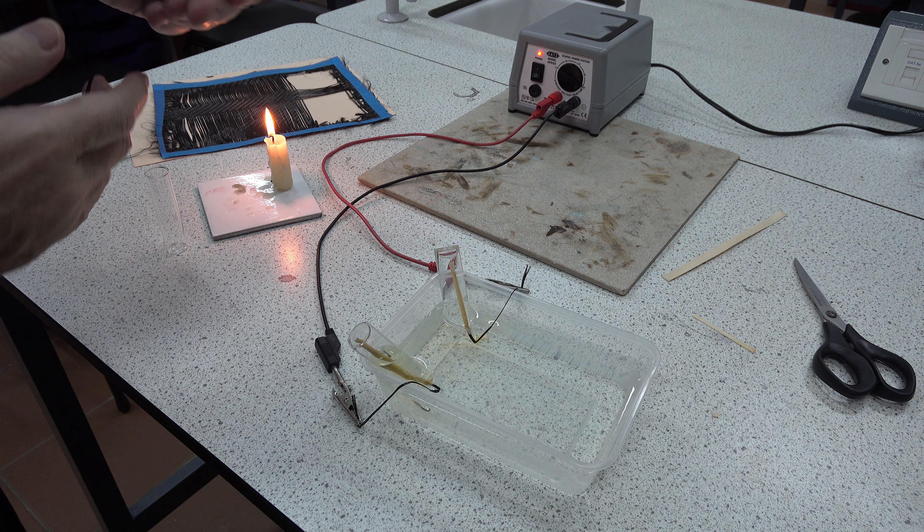We can trap and seal the end with a finger if need be, and insert the tube in whatever container we need to. So that's preparing a carbon fiber electrode for an electrolysis experiment.